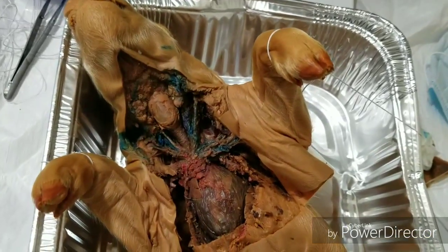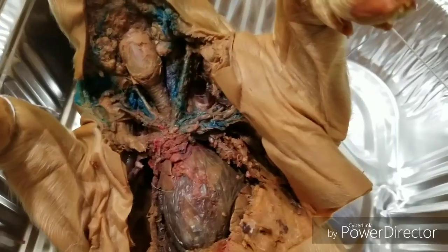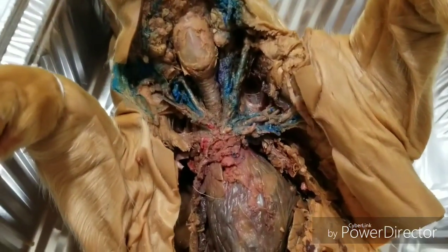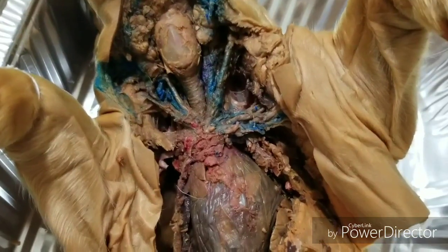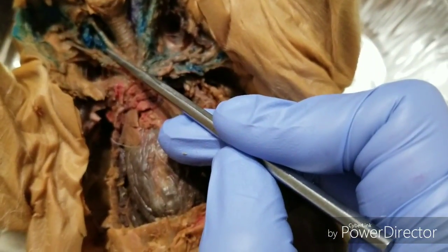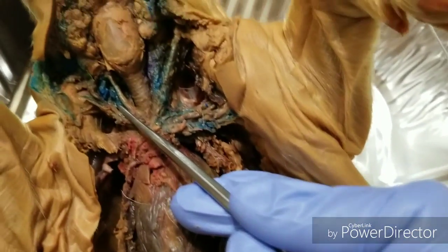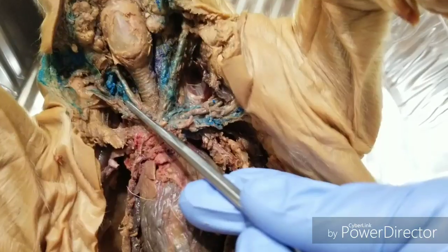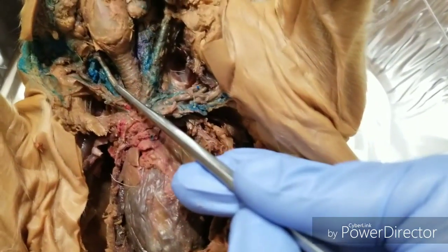Here's my dissected pig. We are going to begin with pointing out where the internal jugular is. As you can see, some ink did explode in my pig, so we're going to try my best. This right here is what I believe is the internal jugular. I believe this is so because the internal jugular is right next to the common carotid artery, which is right here.